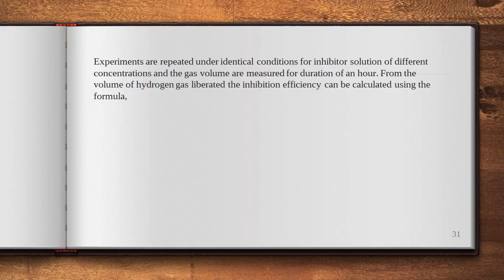Experiments are repeated under identical conditions for inhibitor solutions of different concentrations, and the gas volumes are measured for a duration of an hour.